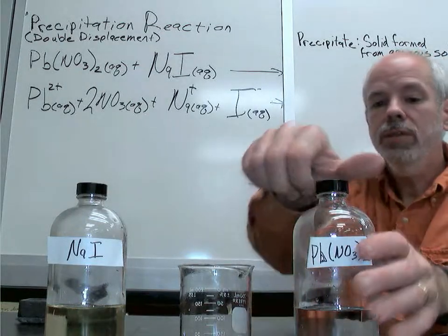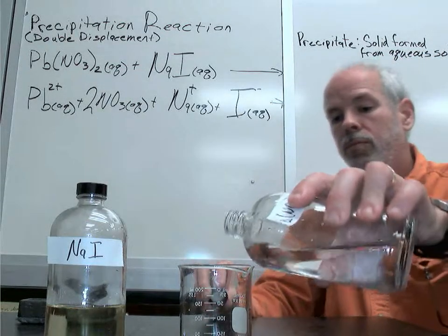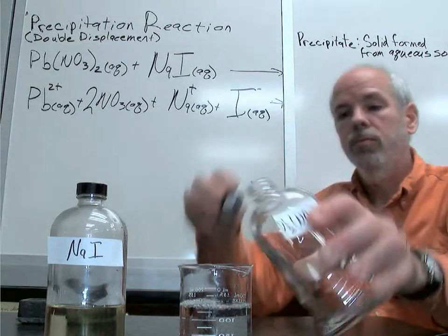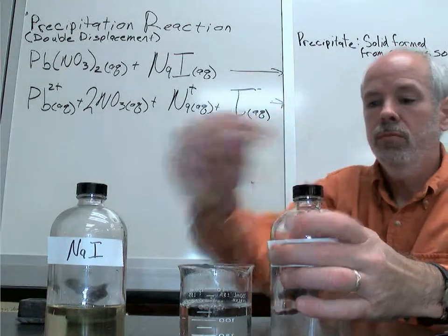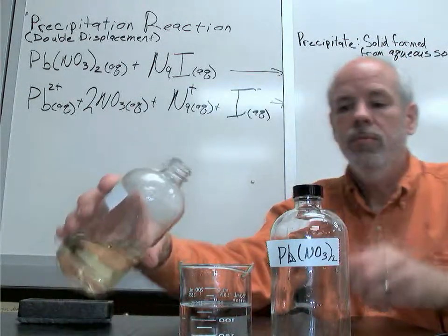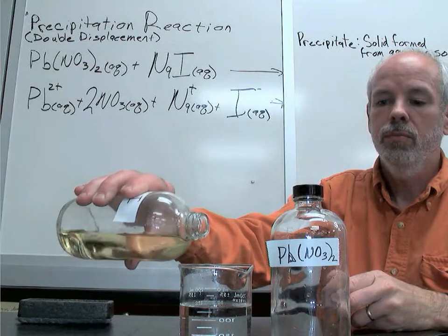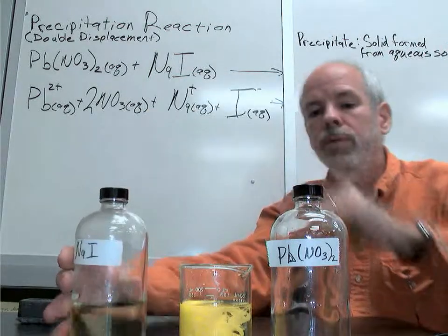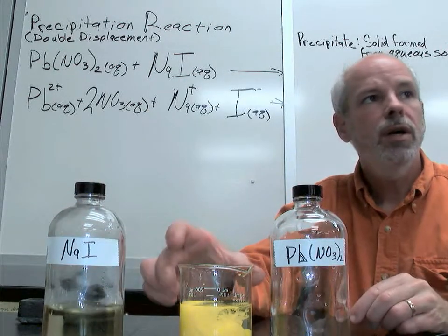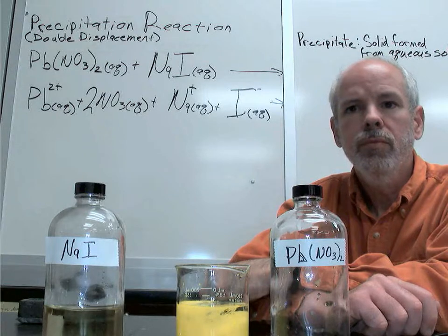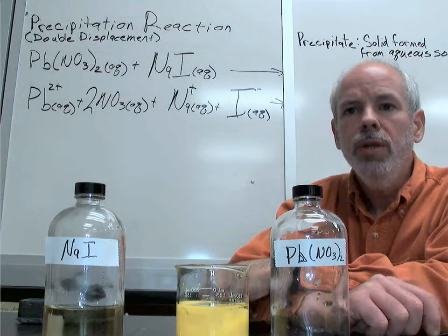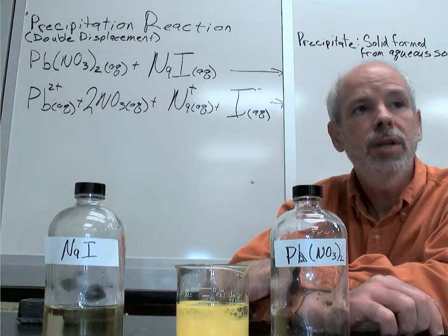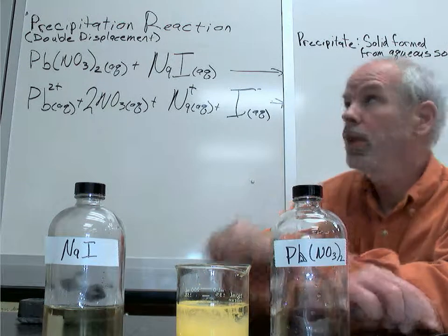And if I mix these two, I see a beautiful yellow solid forming in the beaker — a murky yellow solid. Whenever you mix two solutions and get a murky solid, it's a precipitation reaction.